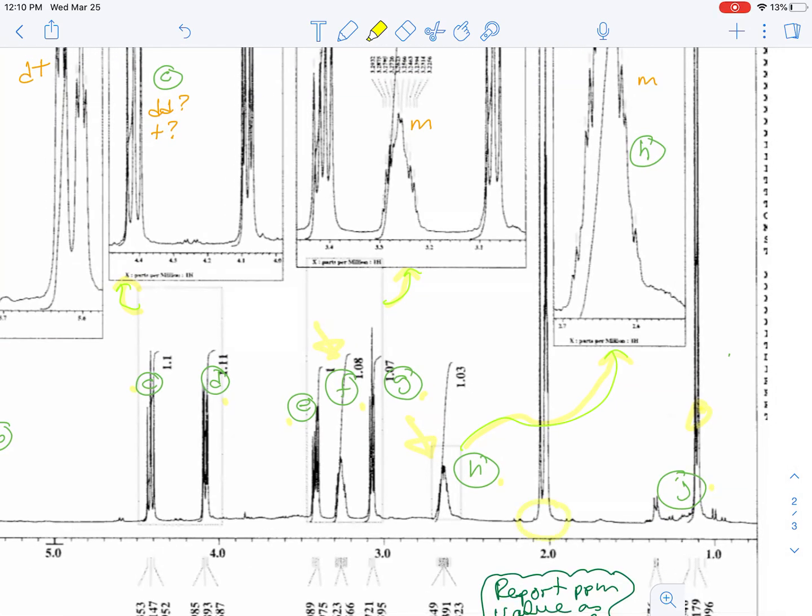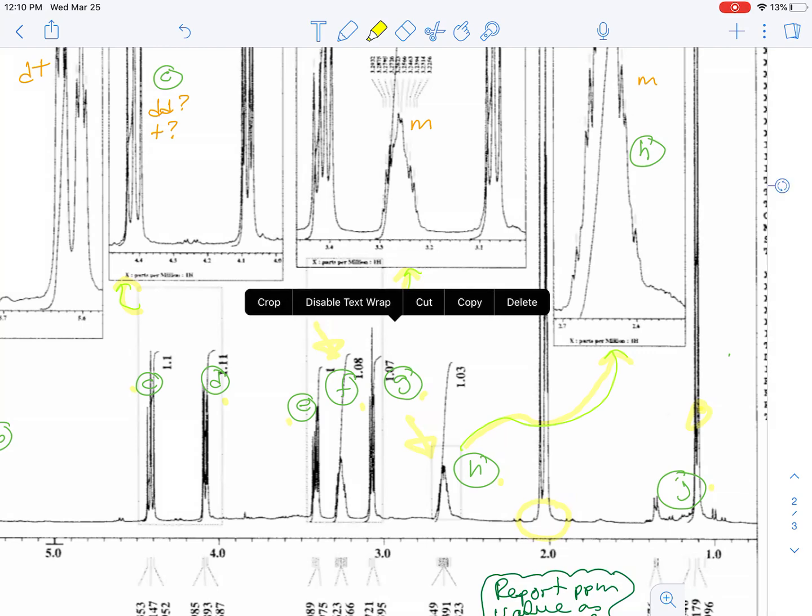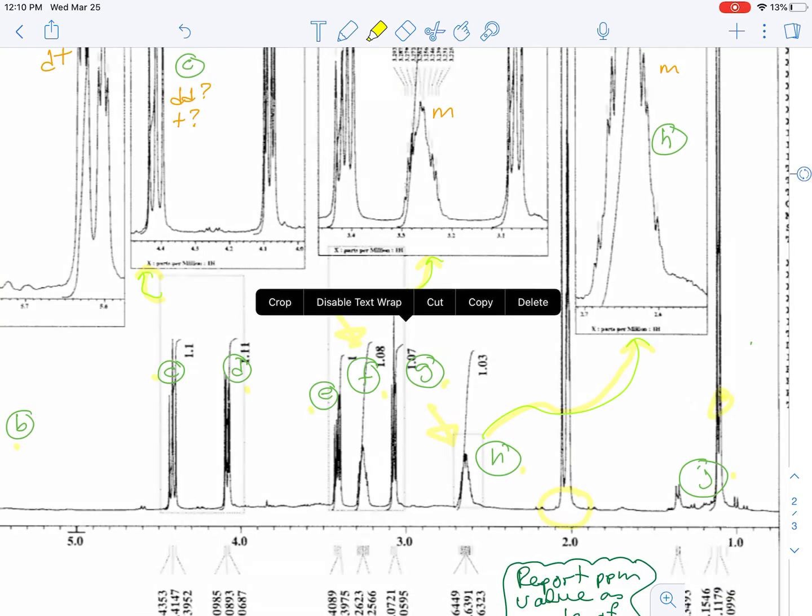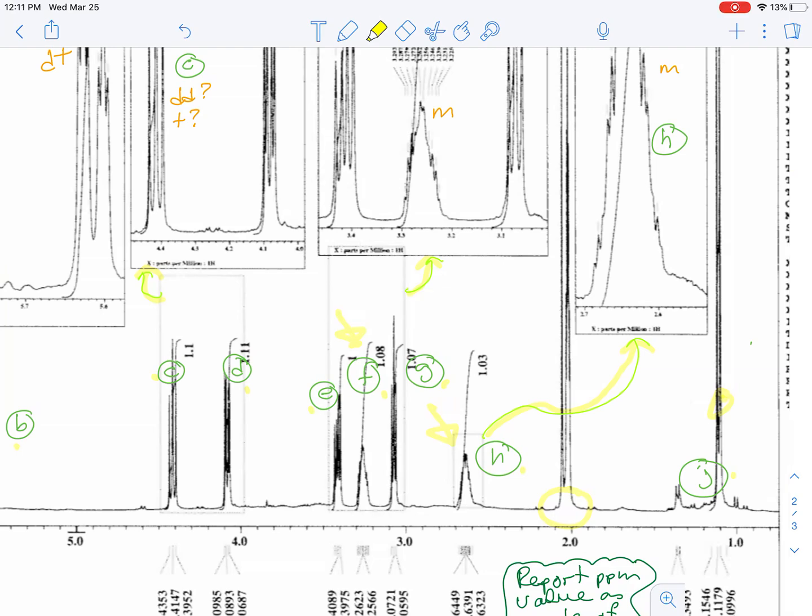This signal here around two - there are actually several signals. One of them is presumed to be combined overlap of the carboxylic acid OH and residual water that may be in the acetone D6 solvent that was used, and because of exchange that shifted further upfield than it would normally be.